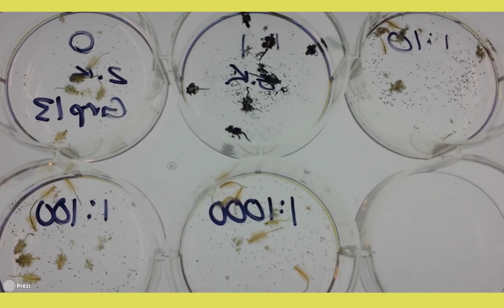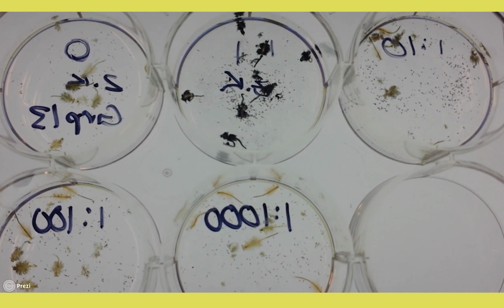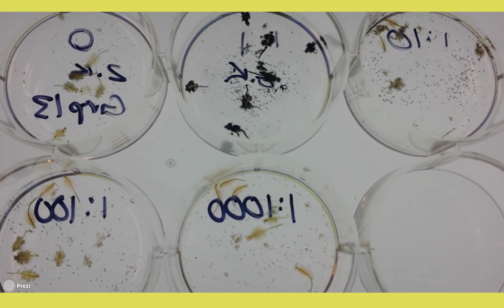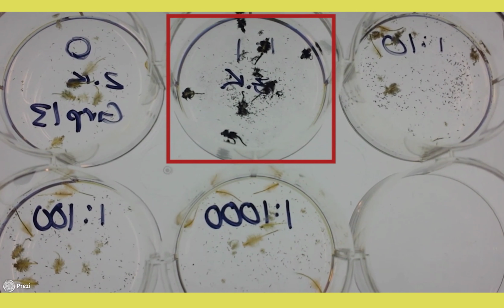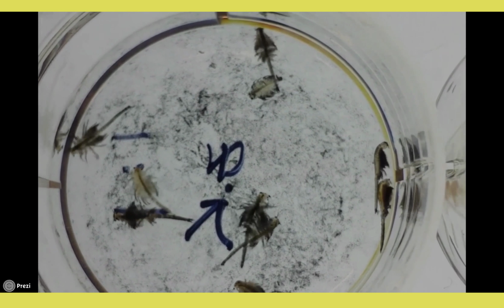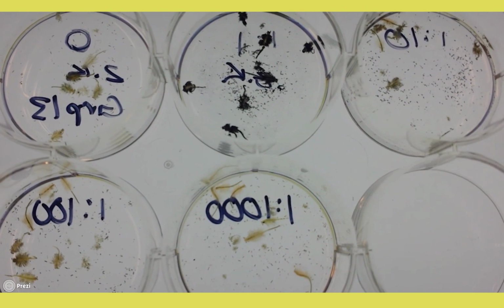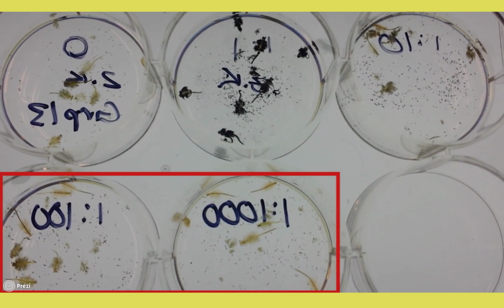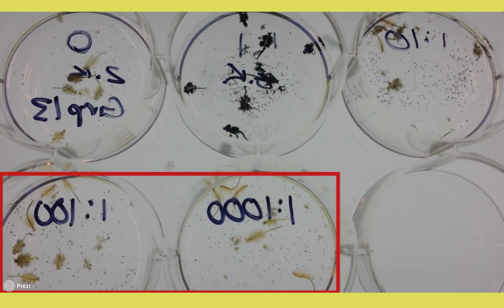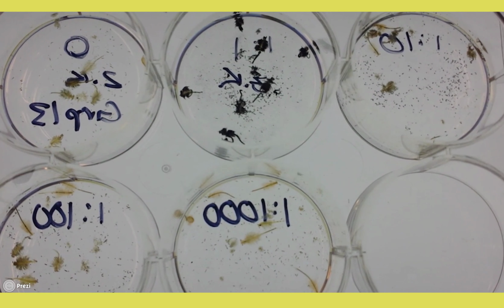After 72 hours, it was observed that the 1-to-1 dilution population was the most affected by the high dose of nanoparticles, killing 90%. The shrimp in this solution were mostly covered in the black solution and started to lose motor skills. As the nanoparticle sample was diluted more, the shrimp were less likely to be affected. For example, the shrimp in the 1:100 and 1:1000 moved faster and survived longer than in the 1:1 dilution and the 1:10 dilution.